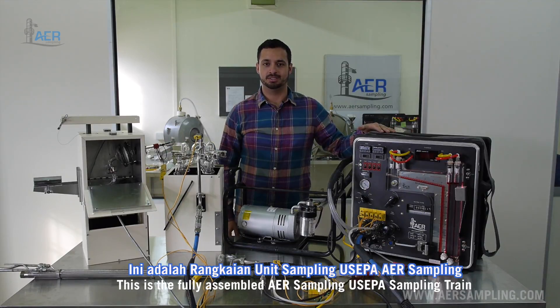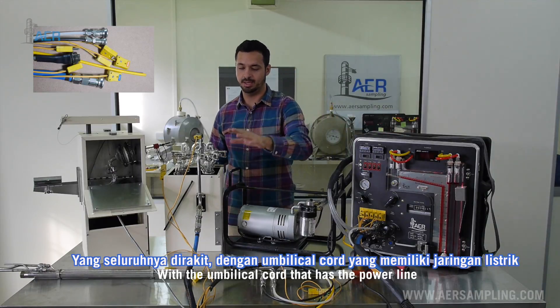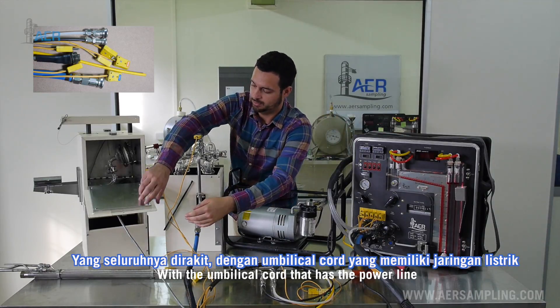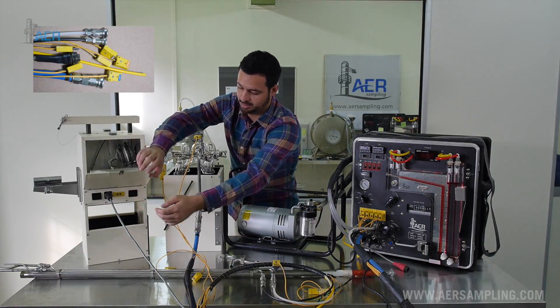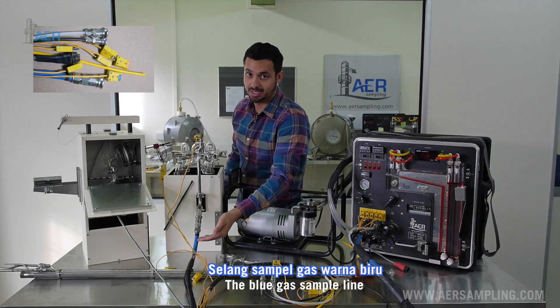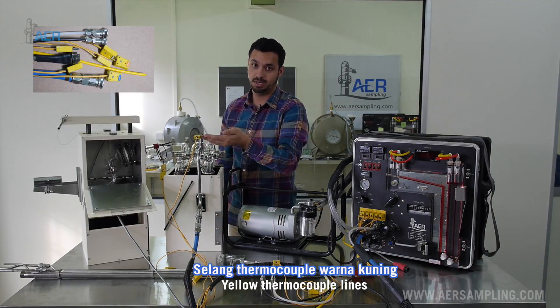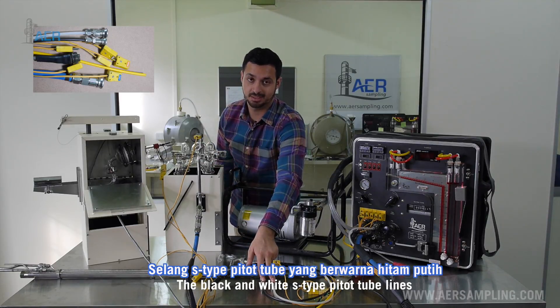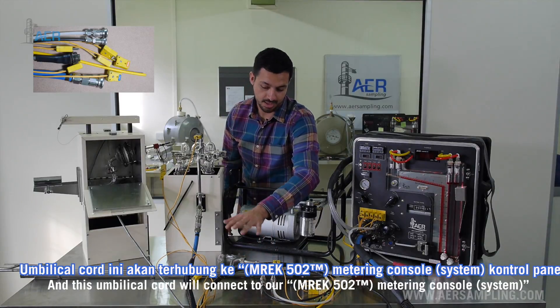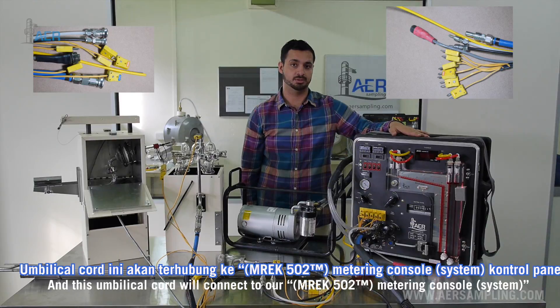This is the fully assembled AER Sampling US EPA sampling train with the umbilical cord, which has a power line that powers the heating box, the blue gas sample lines, yellow thermocouple lines, the black and white S-type pitot tube lines. This umbilical cord connects to our metering console.